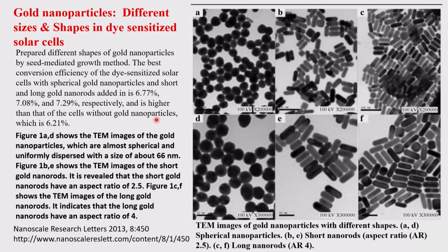In this particular case, you can see with the different magnifications here, gold nanospheres, and here nanorods, and again another kind of nanorods. So what will be different? The difference will be this dimension, which is the diameter versus the length. That is what is basically called the aspect ratio, the length by the diameter. Here also, length by the diameter.